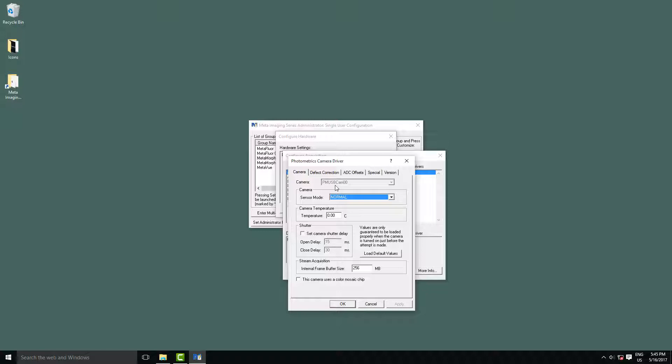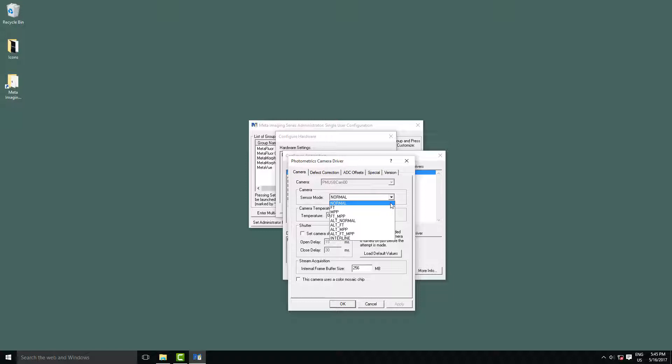The first setting is the sensor mode, and depending on what type of camera you have, you'll either have to change this or won't. Currently we're using a prime camera, which is a CMOS sensor for which we use the standard normal mode. If you're using an EMCCD camera, you'll want frame transfer FT.